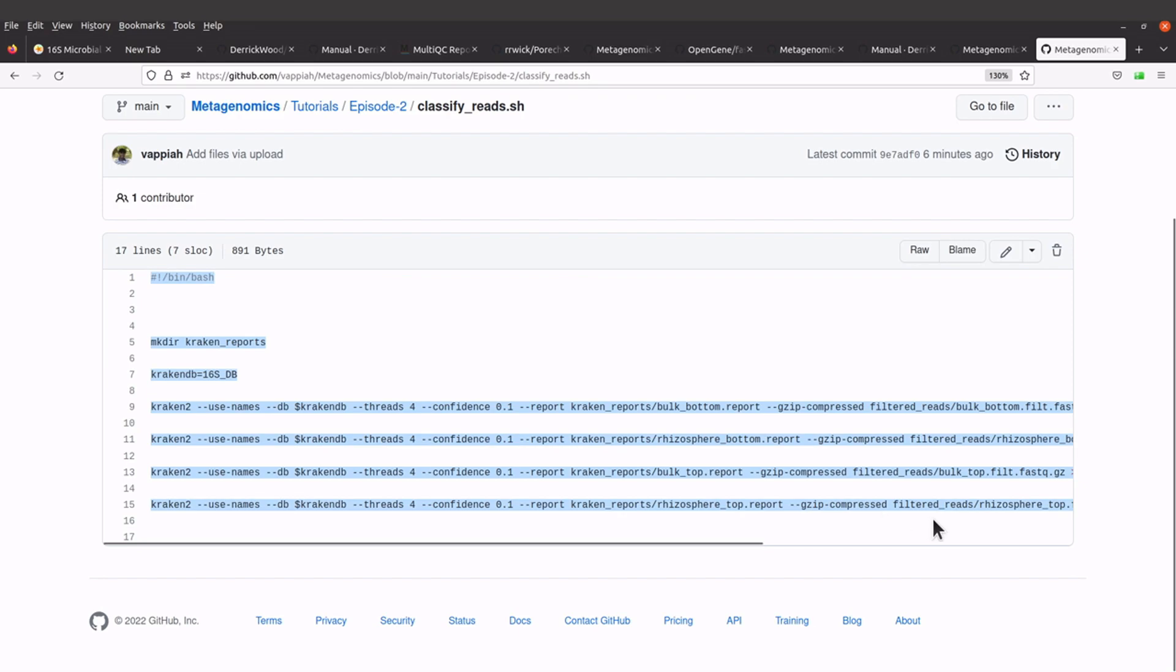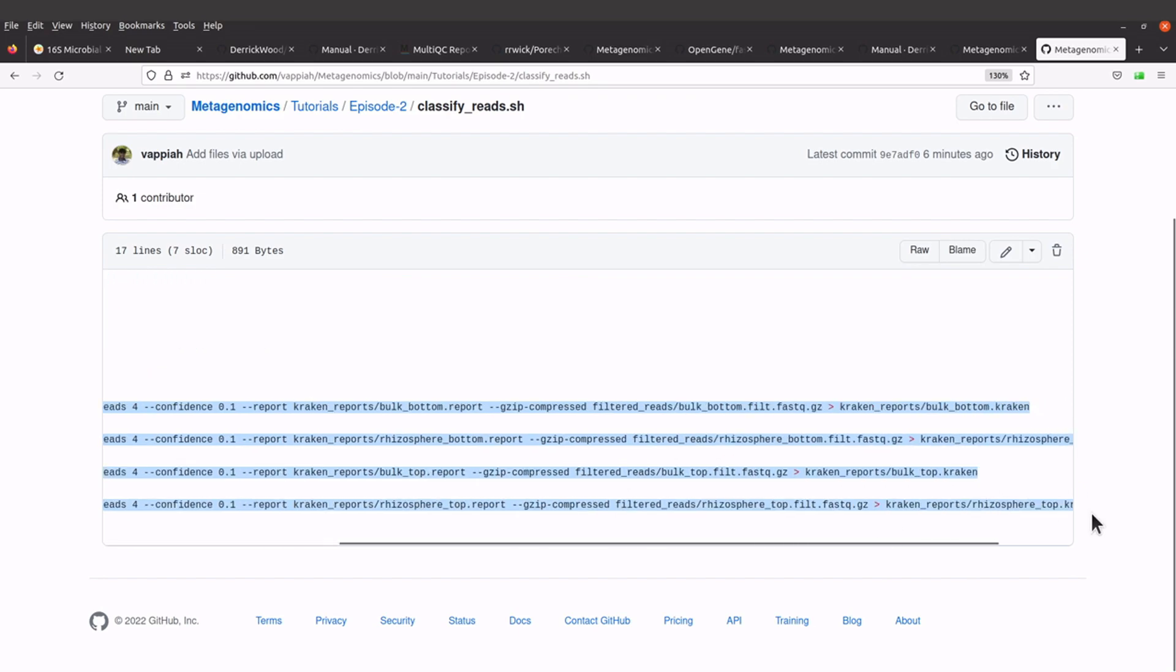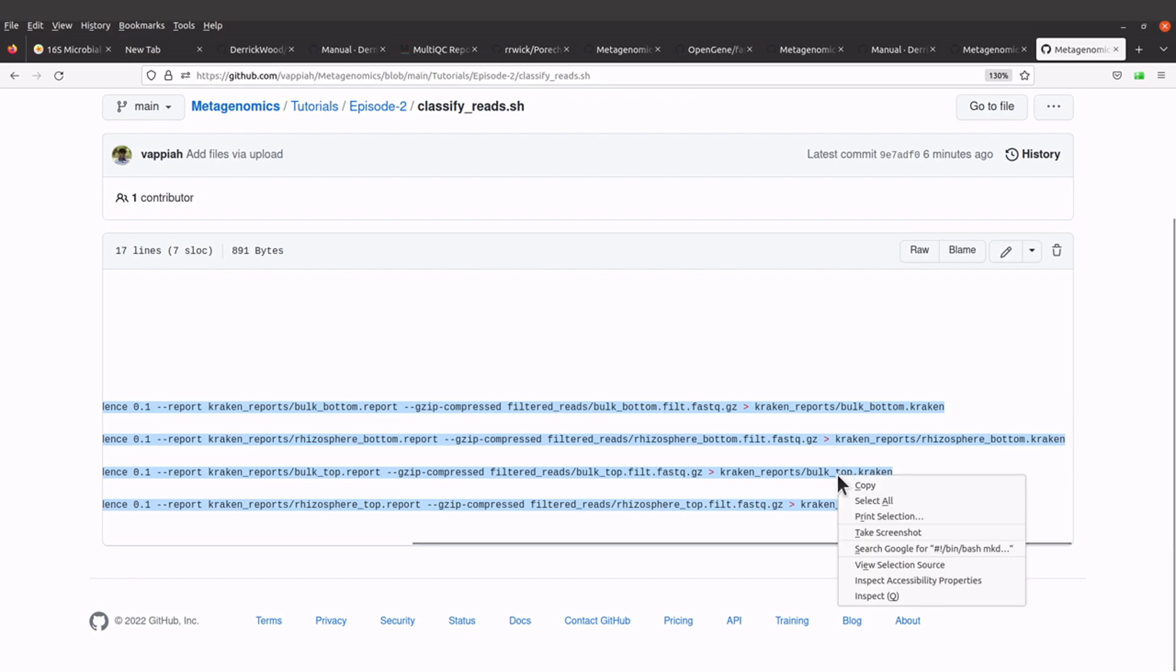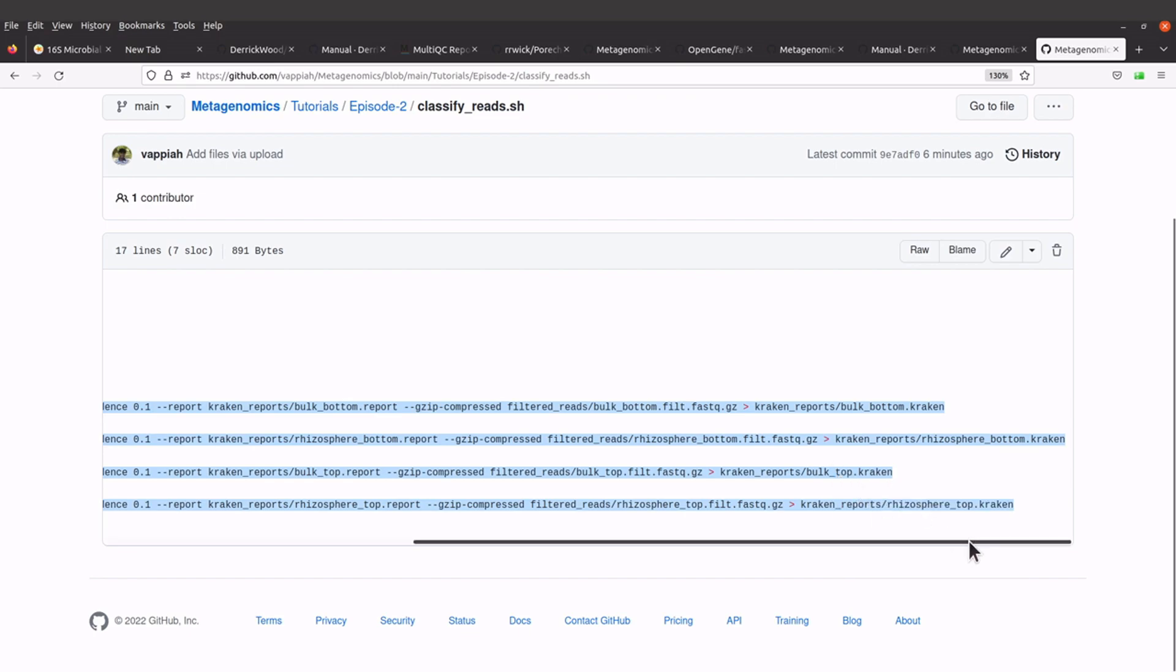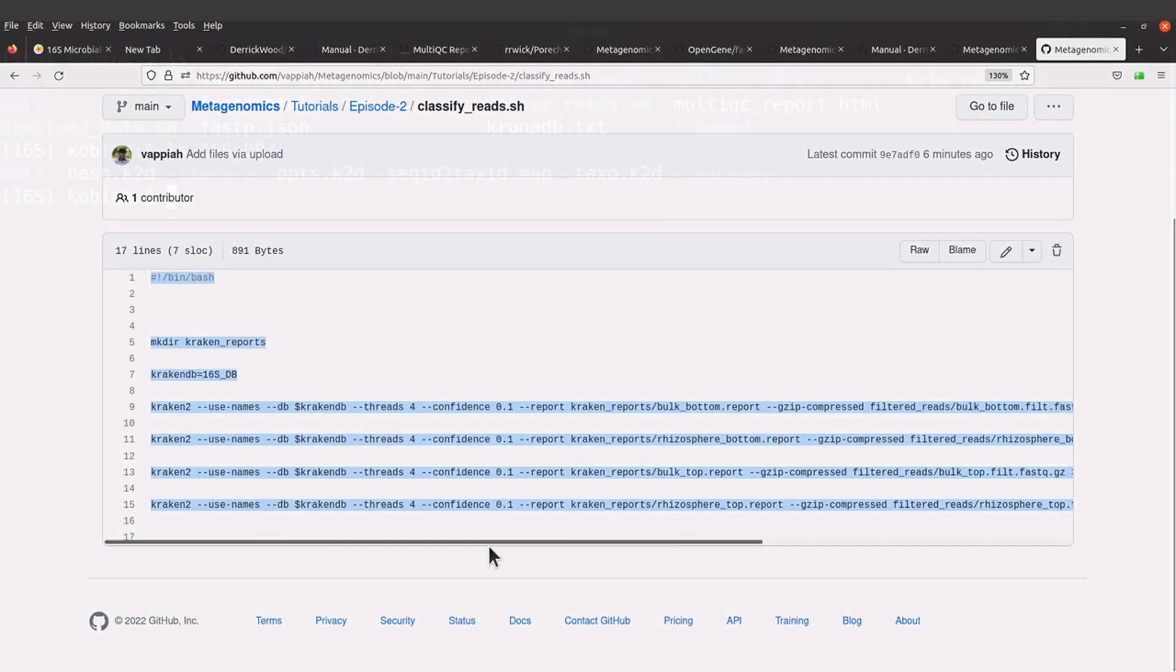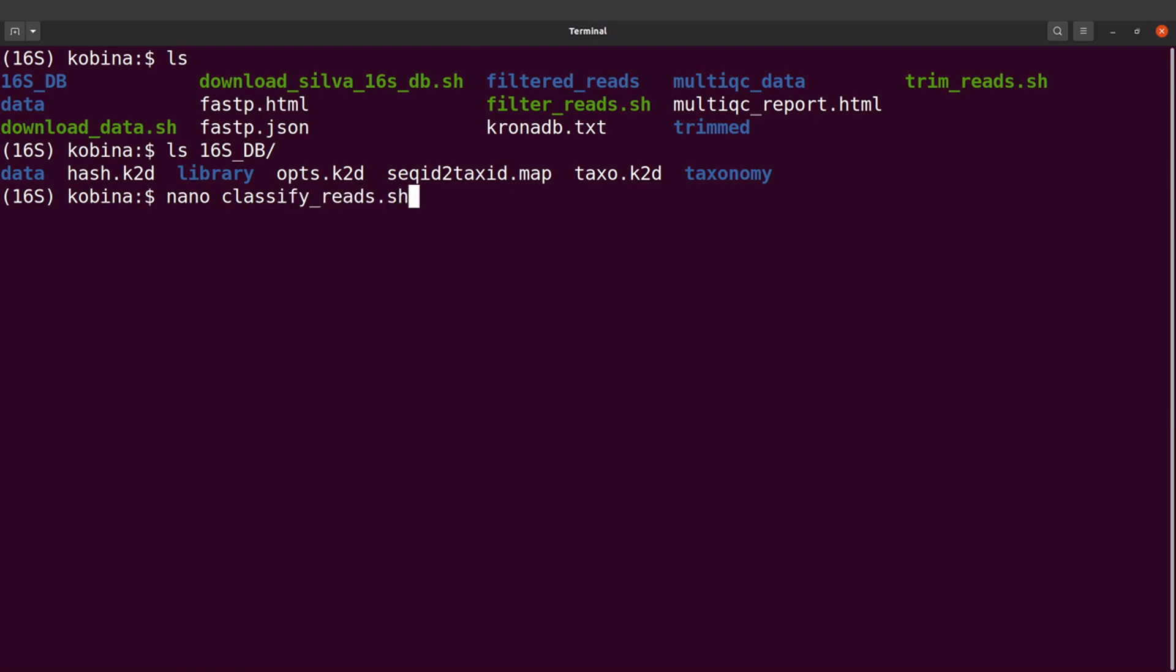You can download the script also and then use it, but I'll copy and paste the commands. On the terminal, I will open a file. I'll say nano classify_reads.sh, and then I'm going to paste the commands there.